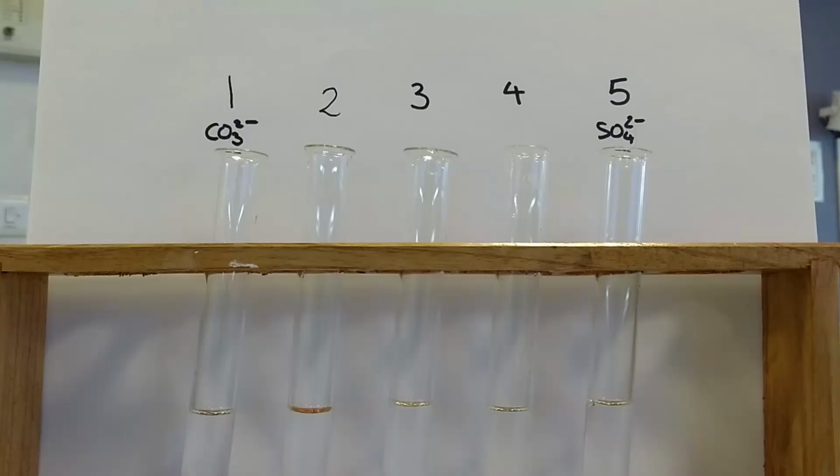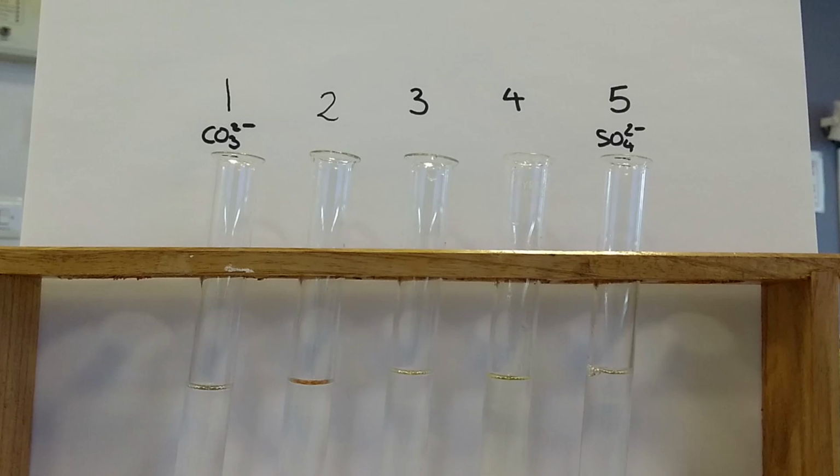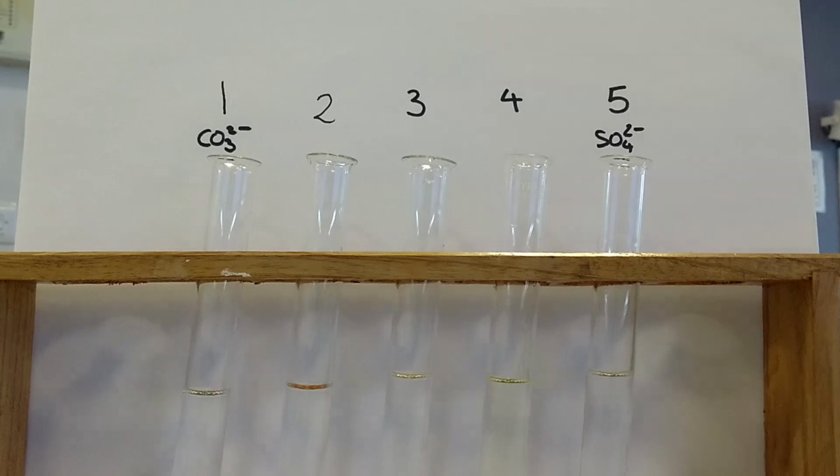The final chemical test is to identify the halide ions present in the unknown solutions. To start, a small sample of each of the unknown solutions have again been placed into boiling tubes. Then, to test for the presence of halide ions, first add several drops of nitric acid. As from the first chemical test, this identifies any carbonate-containing solutions, which we will not test further in this experiment.